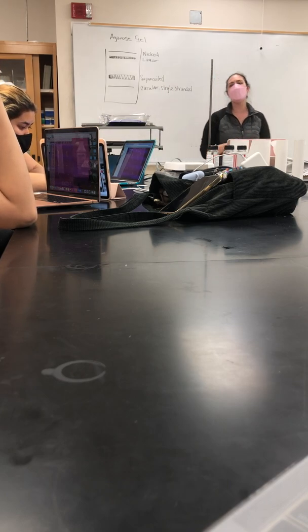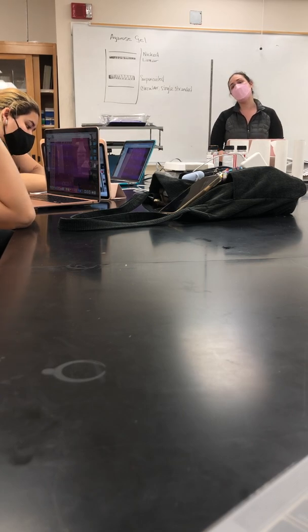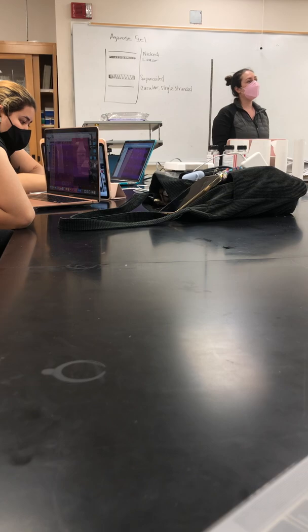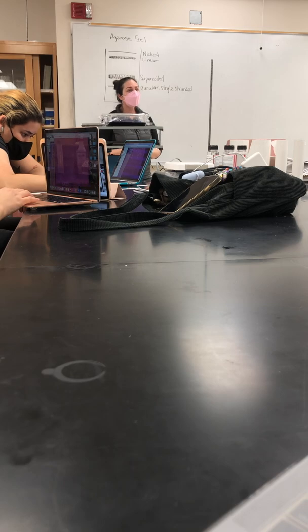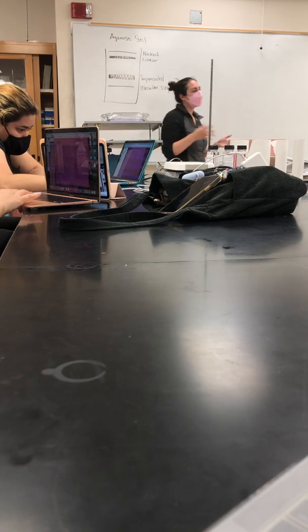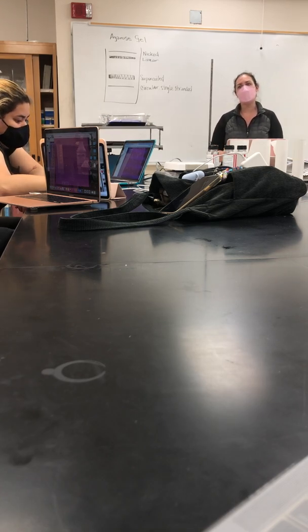So I want you to label the marker, and then you need to identify where your negative and your positive control is, and then just start discussing what you see, okay? That's the point of this experiment, to really see the difference between an agarose gel and an acrylamide gel. You guys talked about it in your intros, and the biggest part is their size range, right? What was the size range for acrylamide?